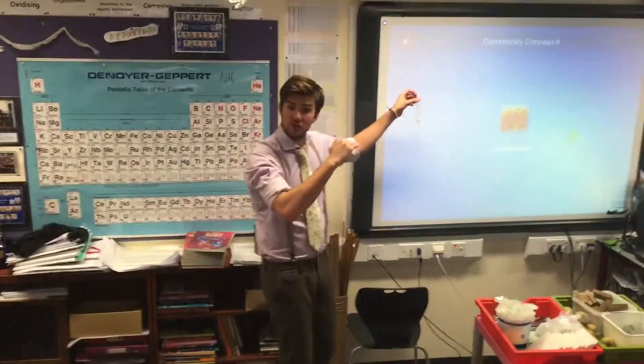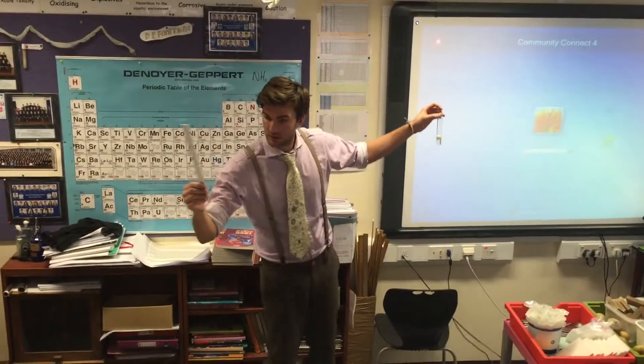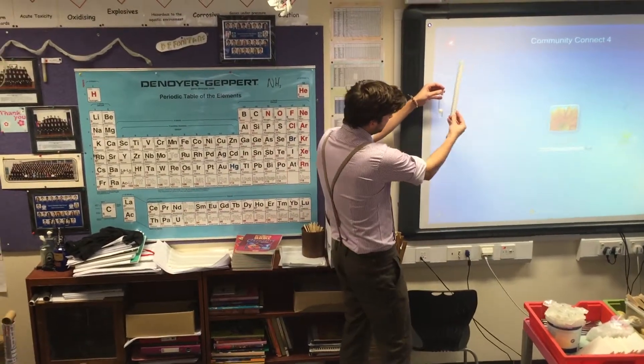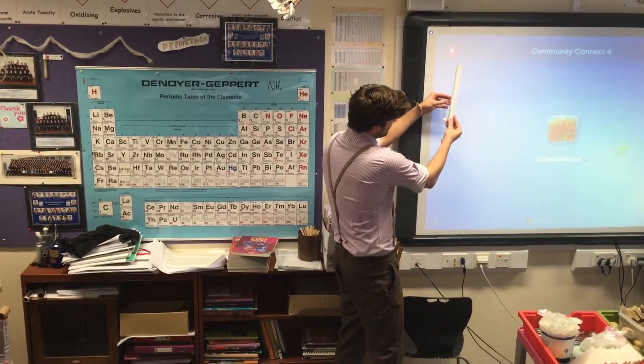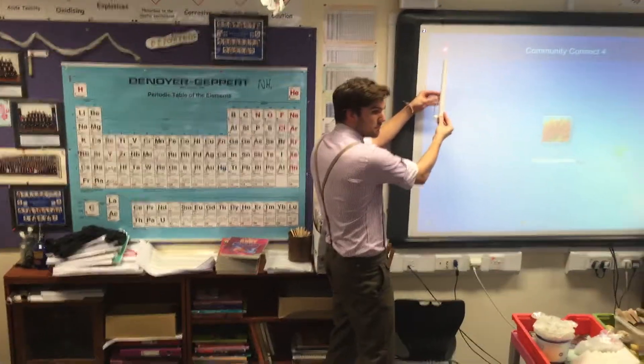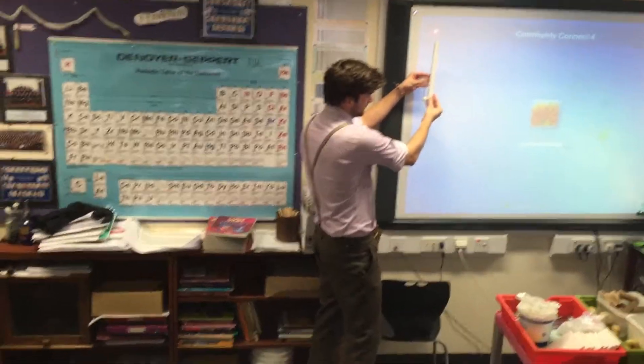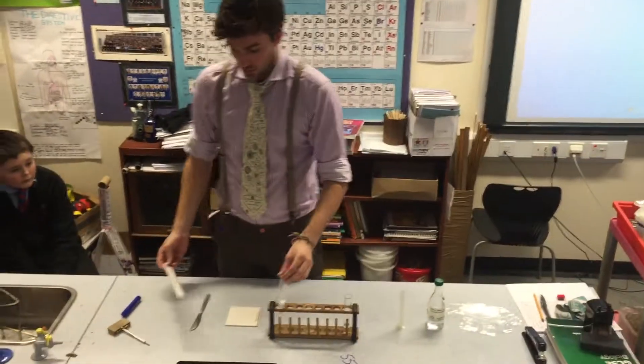Wow. Once that's reached this top, again in millimeters, you're going to measure from the top of the liquid to the top of the bubbles. At present, that is 10 millimeters. So when it grows to its largest point, you make a note of it.